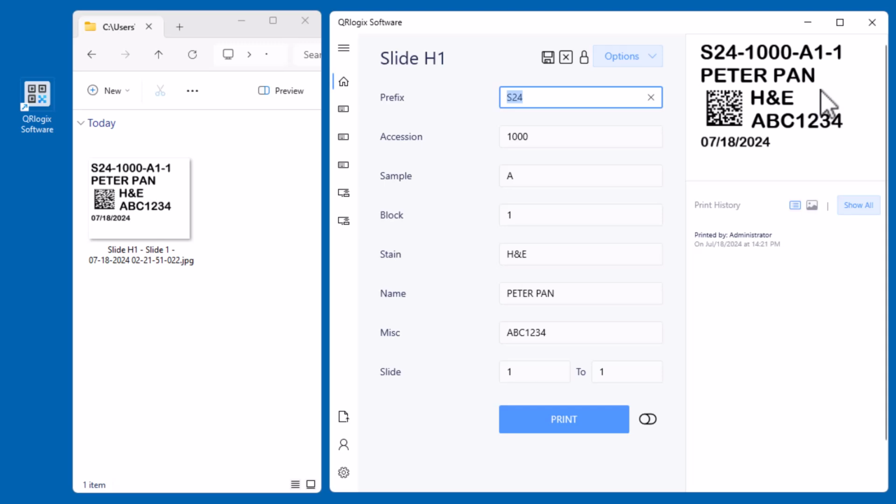And so that's the goal, to get these diagnostic histology labs all using at least as close to this format as possible. The other information is free text, or what's allowable by the lab, so you can put anything you want. Tech initials, doctor, you name it, that's for you to decide.